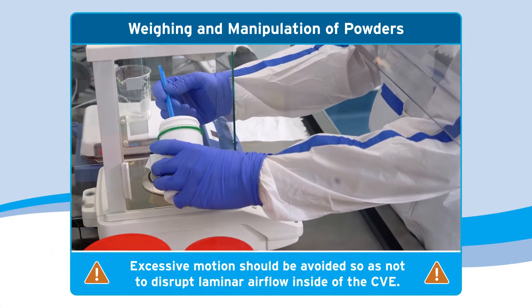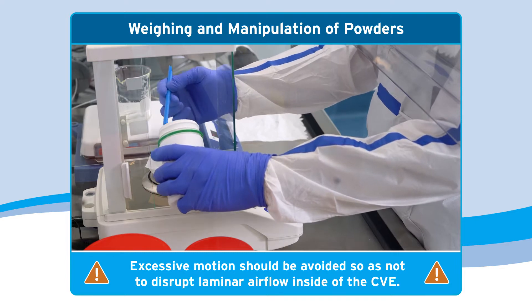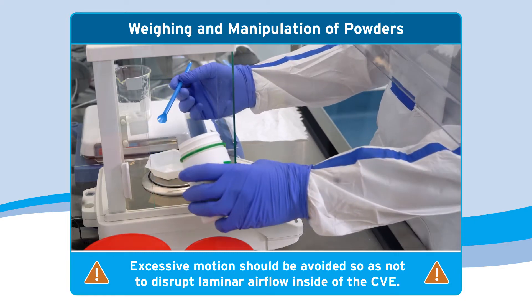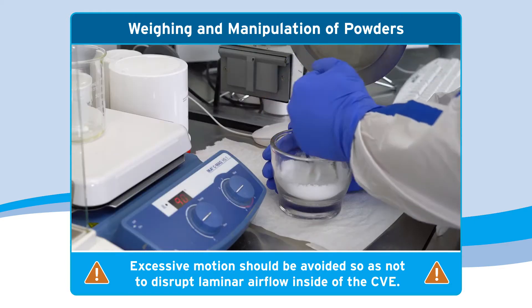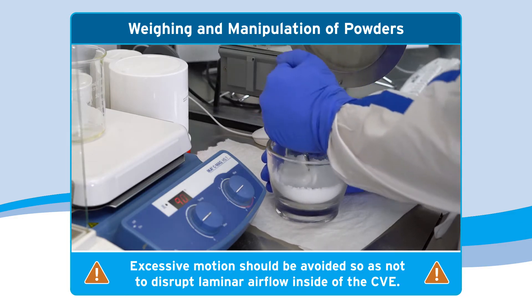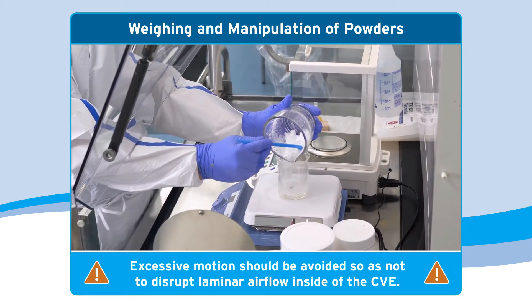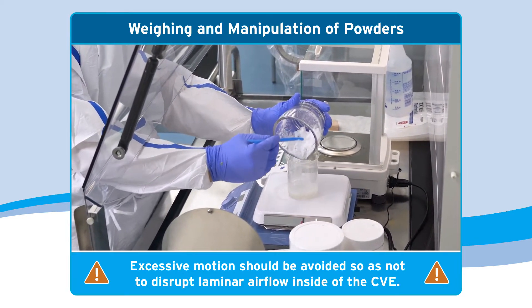The technician should use deliberate, slow, and intentional movements inside of the CVE while weighing powders on an analytical balance. Excessive motion should be avoided so as not to disrupt laminar airflow inside of the CVE, especially during powder manipulation activities such as weighing and pouring.